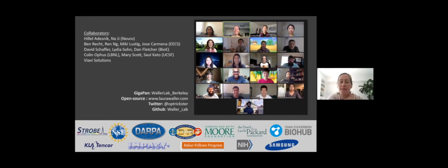Yeah, if what you're after is, okay, so it might be pointless to try to optimize the diffuser in that case because you can't change the dark matter. But if what you're after is to solve for the diffuser, you can certainly do that. You probably need some sort of diversity. We've done this with defocus diversity, or if you come from different angles, maybe that's something that could be possible in this situation. Or you can make priors, like if you know the distances of things approximately, and you know there's empty space in certain parts, you could potentially do that. It's just setting up the problem differently. I don't know how solvable that particular problem would be.